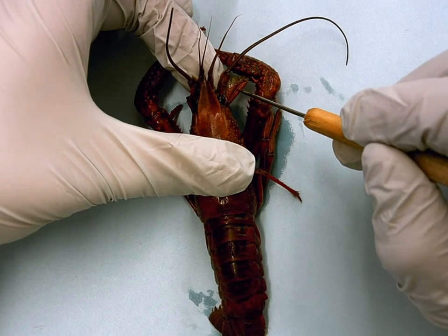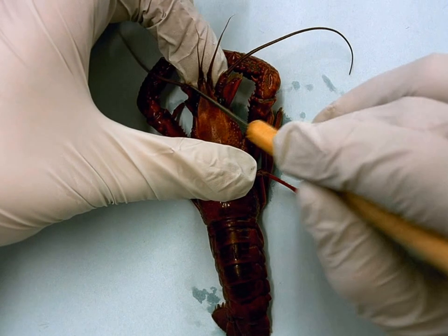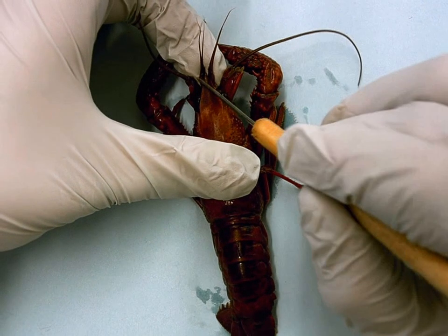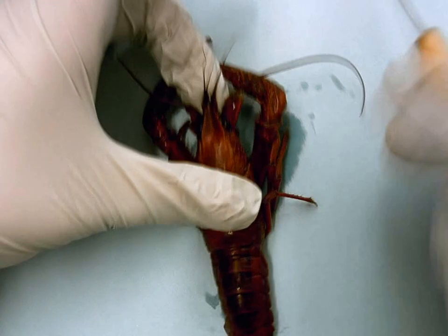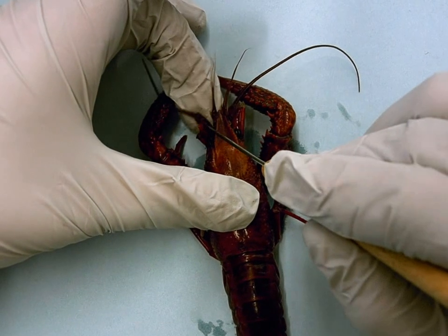The next thing is the second antennae, which would be these ones coming off these large bases over here that I can move out further. Those have really long antennae, and those are just called antennae.